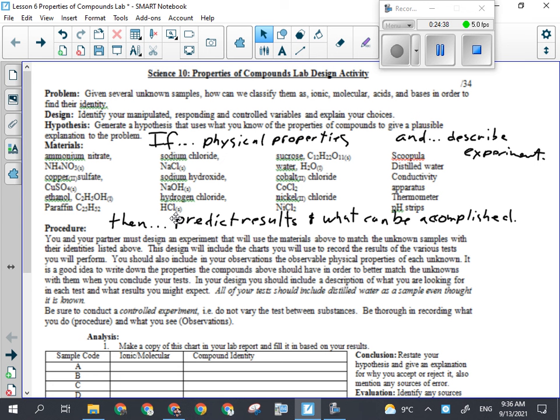Okay. What test should I perform next? Can't perform conductivity until I have something else. Solubility test, right? Now, with the solubility test, again, you don't want to just write "perform solubility test." What does that look like? We need to explain that. So when we're telling them what to do, we should explain that a couple of different devices will be used in the solubility test.